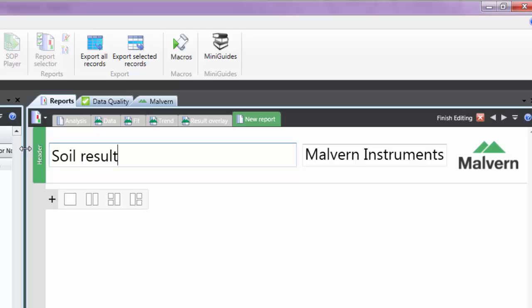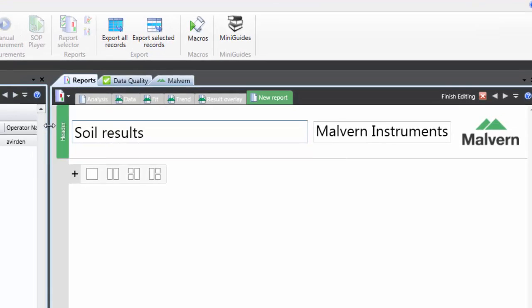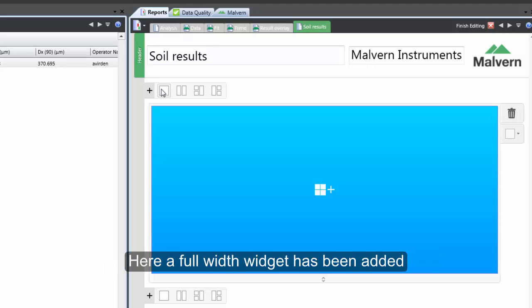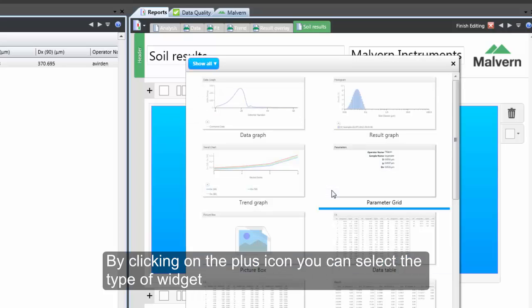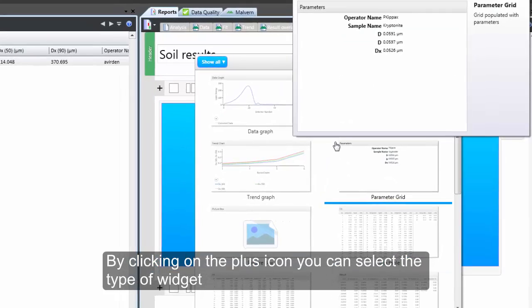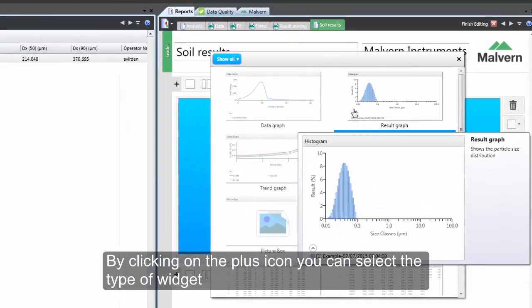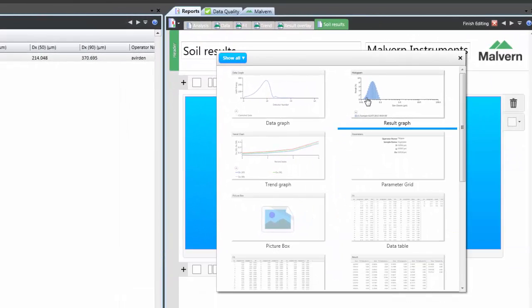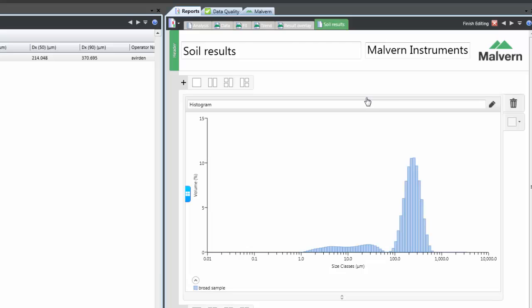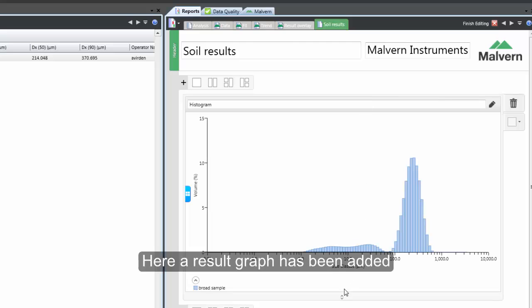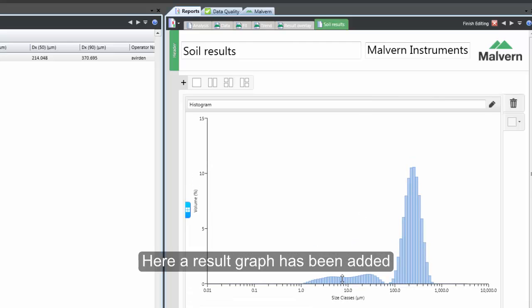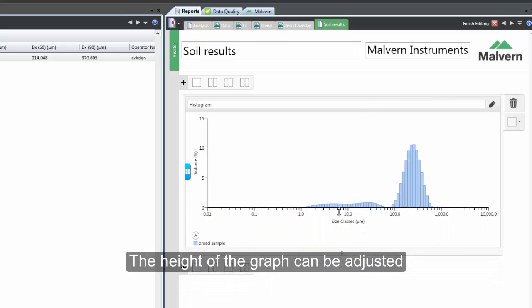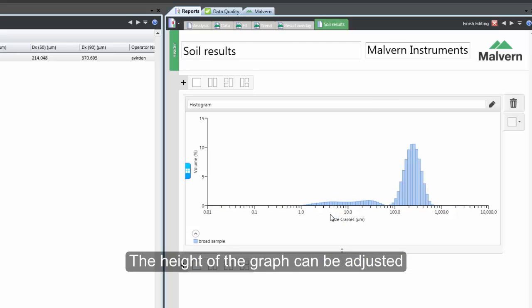We can then add items or widgets to the report and we can choose the format and the size of these widgets. Here I am adding one widget which is the whole width of the report. And by clicking on the plus icon I can choose what type of widget to add. Here I am going to add a result graph. And I can adjust the height of the graph to suit my report.